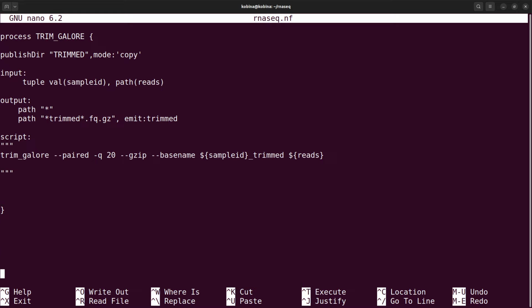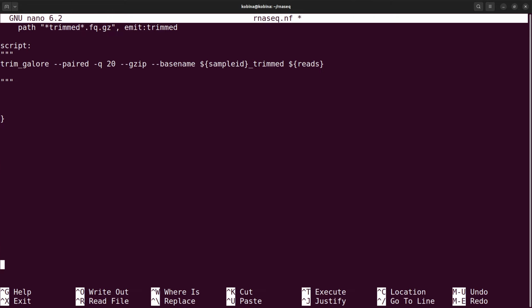Okay, we need to add a new process called fastqc. So I'm going to put that process somewhere here. So I'll just say process and I'll say fastqc. We can also say QC. That's also fine. Okay. Now in the context of this video, let's even use QC rather.